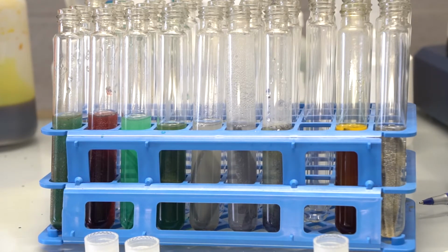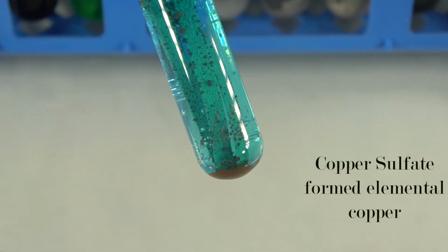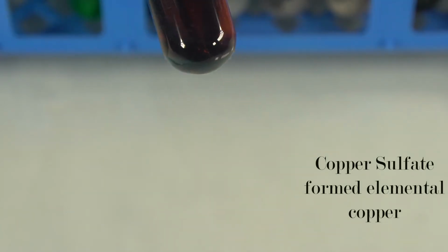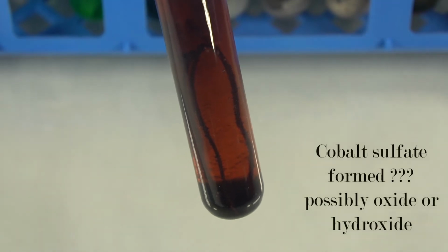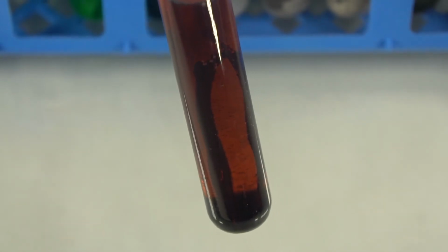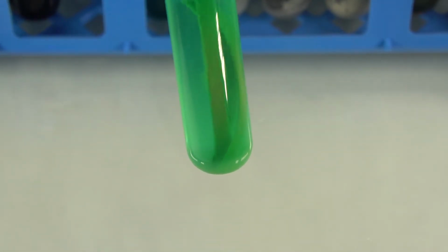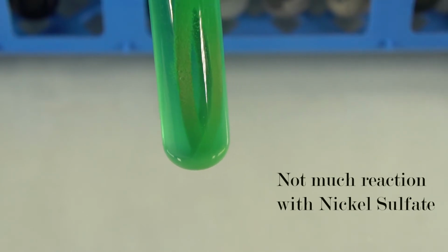So what did the reaction with the magnesium ribbon give us? Copper(II) sulfate gave us elemental copper, as was expected. With cobalt, we produced a beautiful blue cobalt hydroxide that fell to the bottom of the test tube. But the magnesium ribbon also turned very black, which means there's either some element or compound that also formed on the magnesium ribbon. There was no visible reaction with nickel sulfate other than some hydrogen gas.